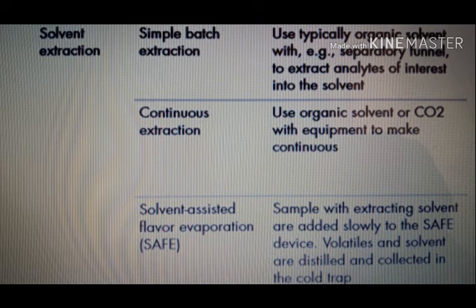Lastly, solvent assisted flavor evaporation, or SAFE for the short form. The sample with extraction solvent is added slowly to the SAFE device. Volatiles and solvent are distilled and collected in the cold trap.